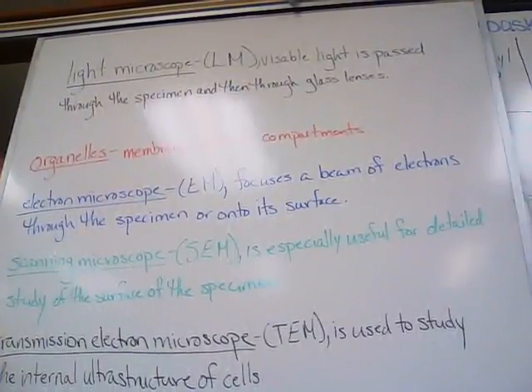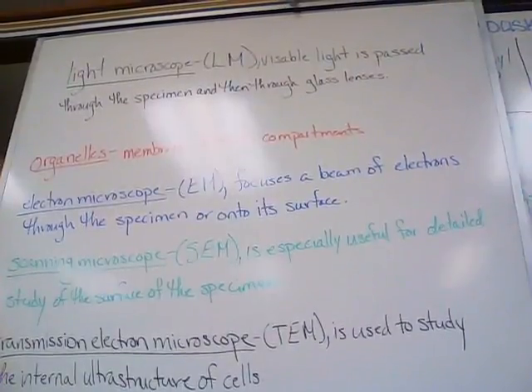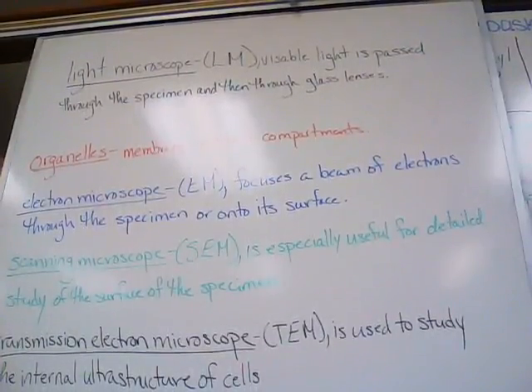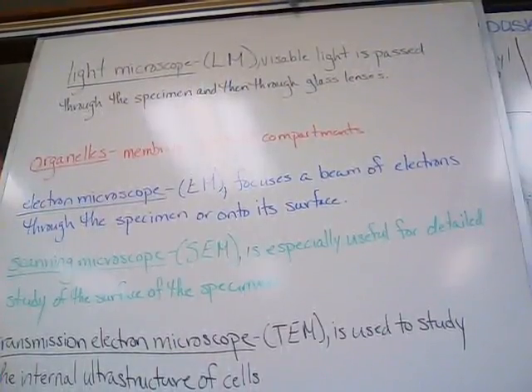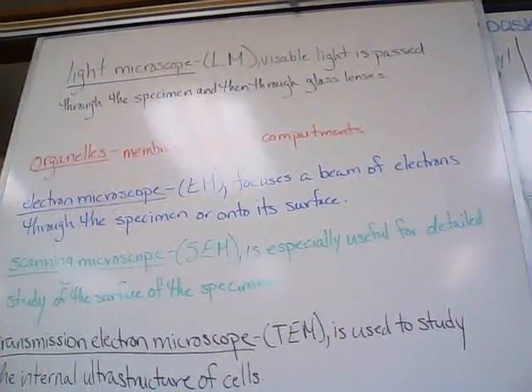Electron microscopes reveal many organelles and other subcellular structures that are impossible to resolve with the light microscope. But the light microscope offers advantages, especially in studying living cells. A disadvantage of electron microscopy is that the methods used to prepare the specimen kill the cells. Also, specimen preparation can introduce artifacts, structural features seen in micrographs that do not exist in the living cell, as is true for all microscopy techniques.